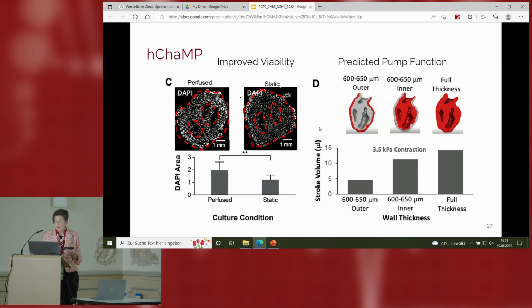We think, well, we know already that with perfusion, we're going to get a much thicker muscle mass. So already just looking at the expansion of stem cells in a perfused versus static culture, these individual cells won't go on to proliferate. Eventually they'll be lost, and we'll just end up with that layer on the outside that you saw before. Here we're seeing big colonies right away that will be differentiated into muscle.